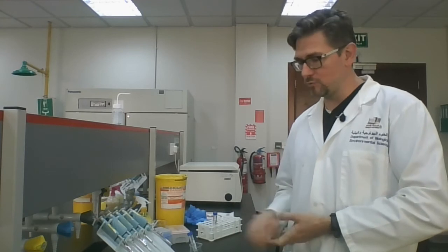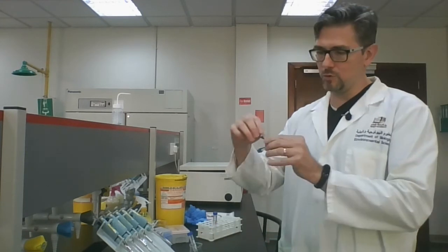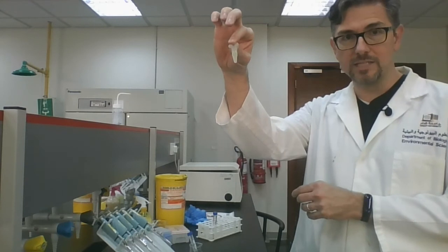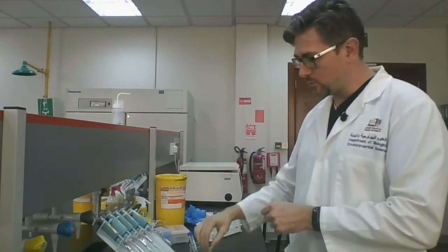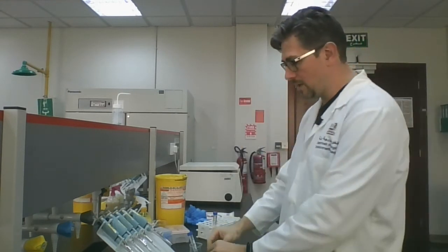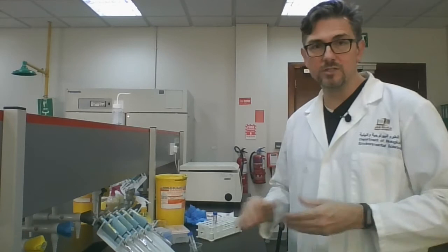In this lab, you will be taking these tubes that contain some bacteria, and you will be extracting plasmids from them, okay? Now, we have two tubes, which should make it easier for you to balance things. So you're going to have something that you can easily work with, two samples. And you'll be able to centrifuge them together, so you don't have to worry about waiting for somebody else to have a sample ready to go with you.